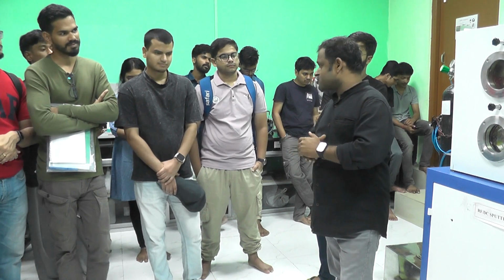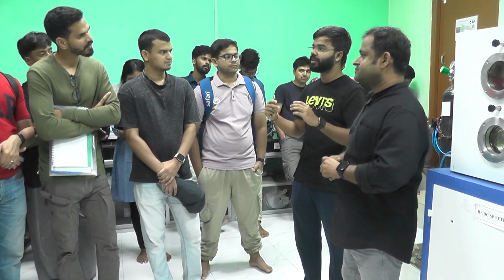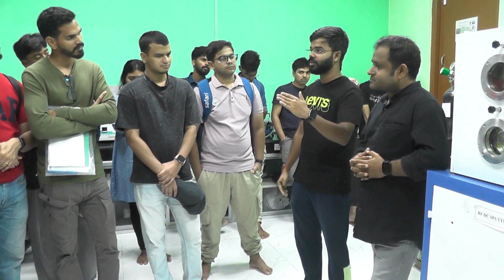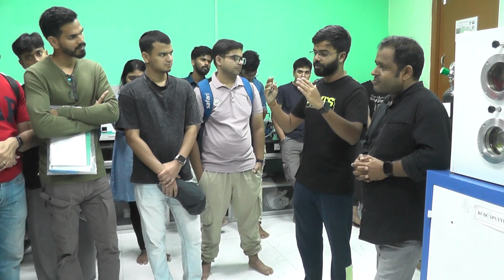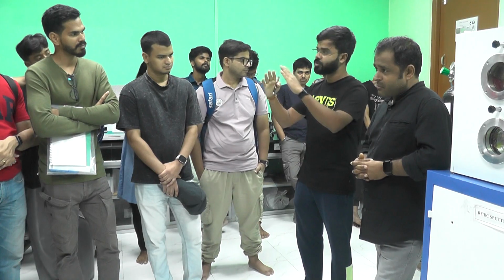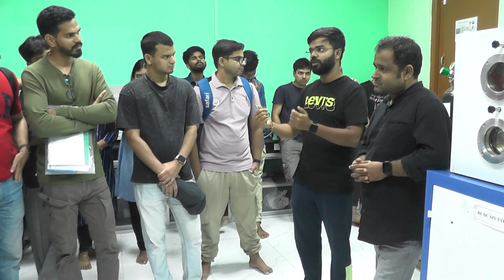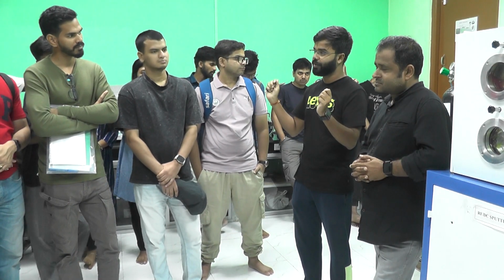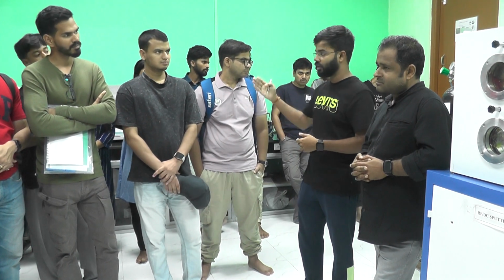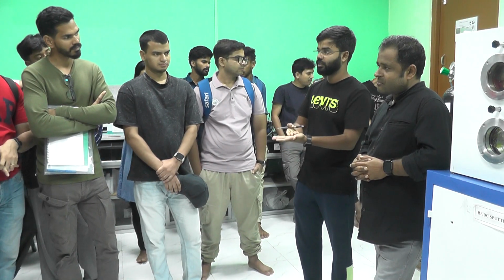People are using 3 magnetrons also. As sir has already discussed in the theory class, there is also a technique called co-sputtering. In co-sputtering, one can be a chalcogenide, one can be another material. We use the RF power source for both of the sources at a single time. Here, as you can see, as sir said, one shutter is closed and another is open. Here, both of the shutters are open, and this is doing co-sputtering. After the deposition is done, we do other techniques like annealing and etching to get the exact structure.